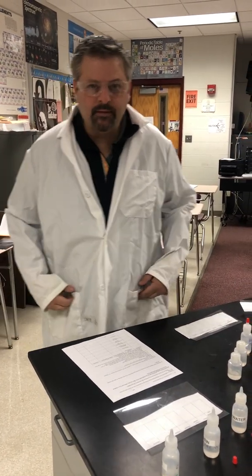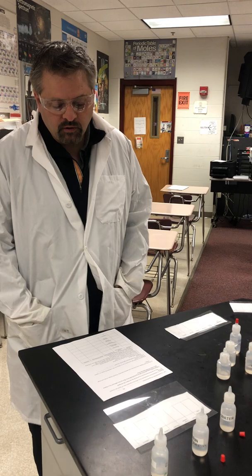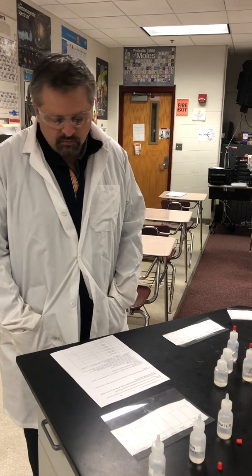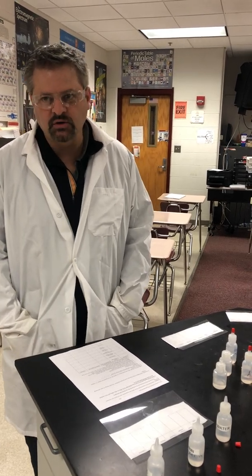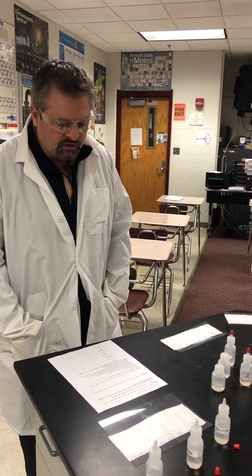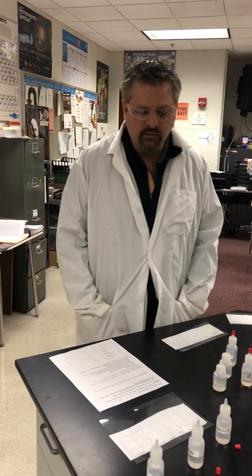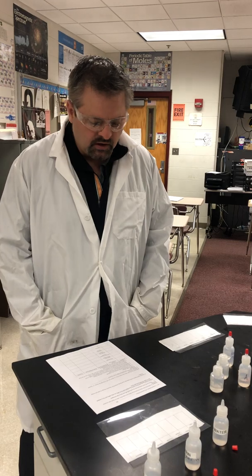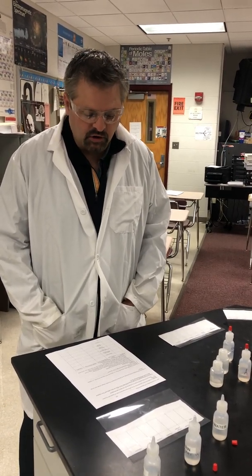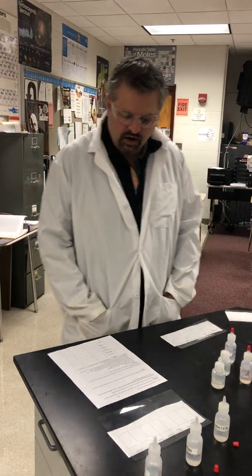Today we're going to do the lab on looking at evaporation rates, and based on that, compare the strength of the different intermolecular forces within the different liquids. If you remember, an intermolecular force is a force of attraction between two different molecules. There's three different ones that we talked about, so make sure you answer those in the pre-lab ones. And if you have any questions, please feel free to ask, and I'll be happy to look over your pre-lab questions to make sure they're correct.